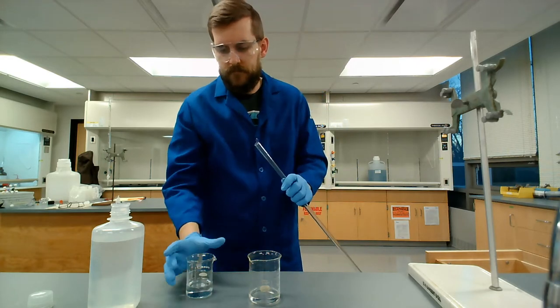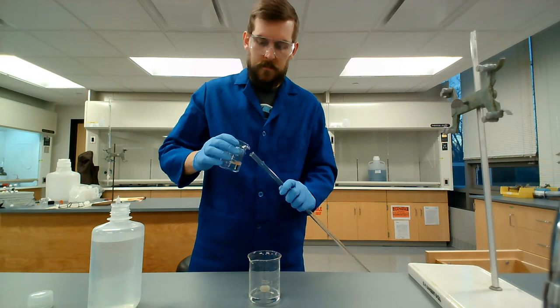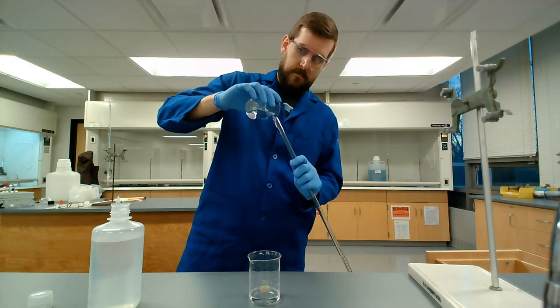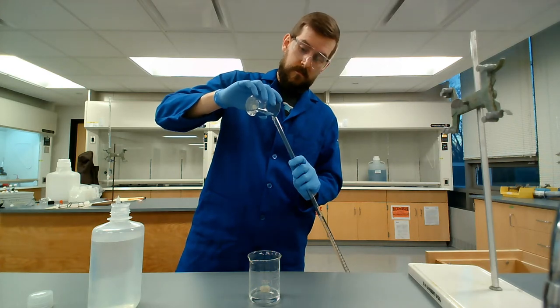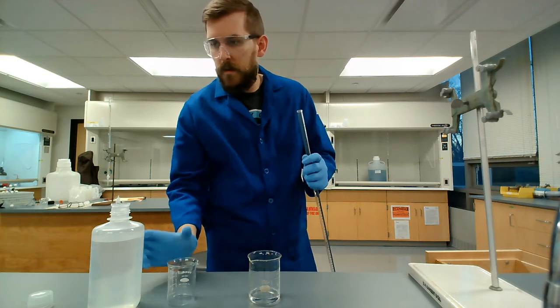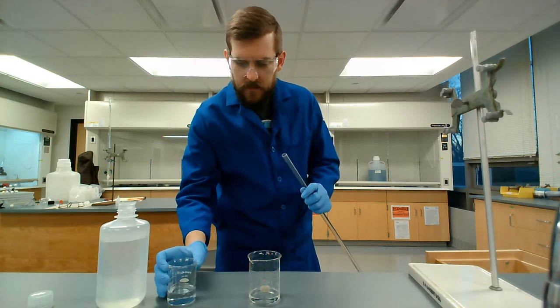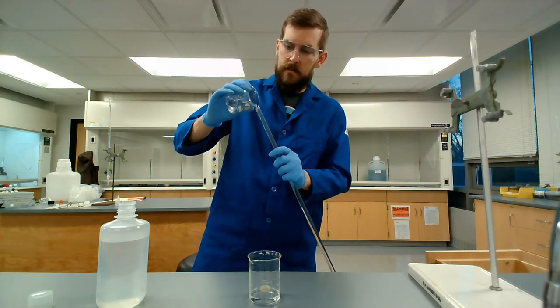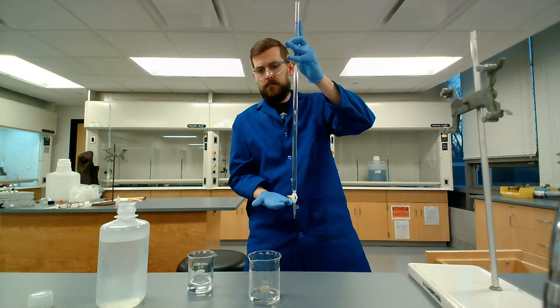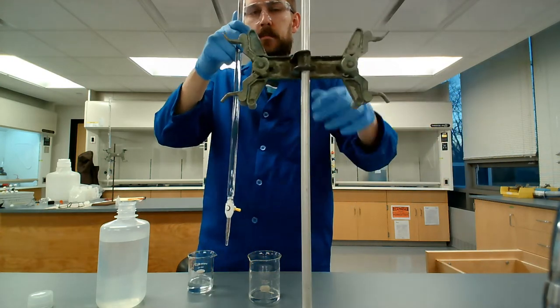And now fill the thing. Make sure the stopcock is closed so that it's perpendicular to the buret. And then fill. Right. And just fill it near the top. It doesn't have to be all the way up at the 0.00 line. It can be somewhere between like 0 and 5. It doesn't really matter. Just don't ever waste time getting it to the exact 0 starting line of the buret, just somewhere close to the top. Right. So now this thing is full. I'm going to bring it back, clamp it into my stand.